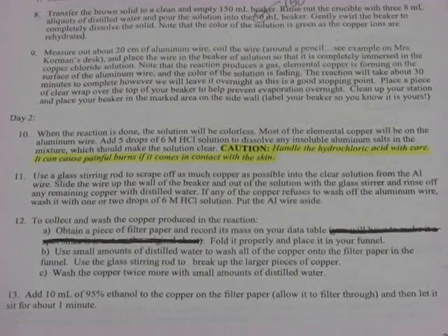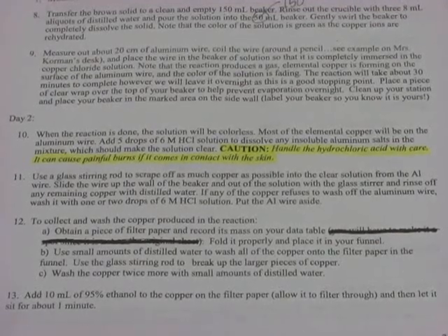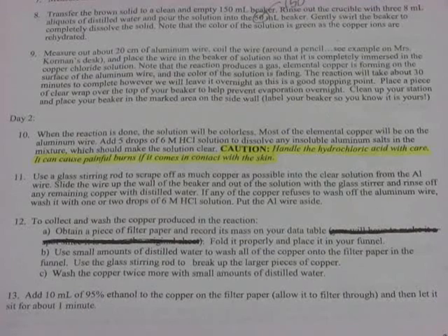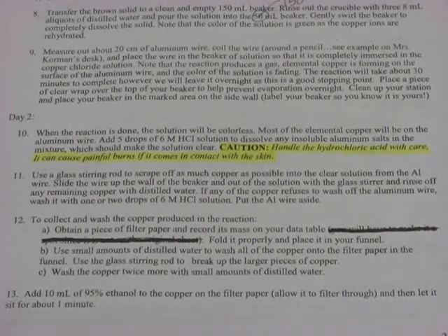We will follow normal safety procedures when completing this lab. You'll wear your goggles from the time you step into lab until you are leaving. You'll wash your hands both before and after. You'll clean off the lab station when you're done by wiping it down.